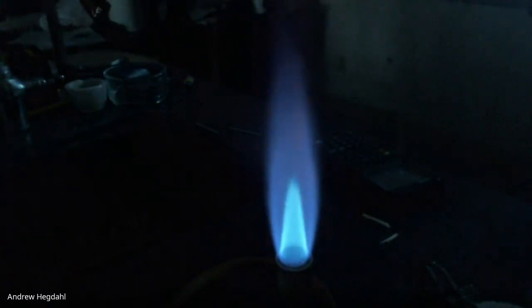So now I've got a glowing ember on my wood splint. At each of your lab stations, you should have a beaker with water. And when you're done with your wood splint, you put it into your beaker here. Okay? So we're doing a flame test lab. We're not burning our wood splint. So just stay focused on what we are doing in the lab.